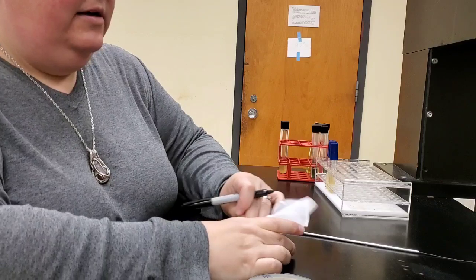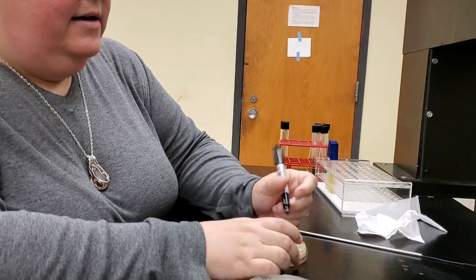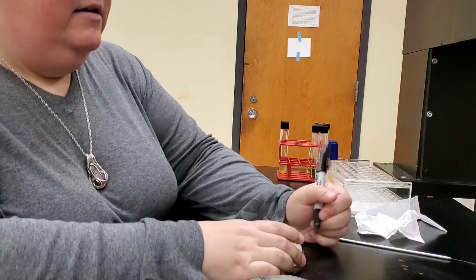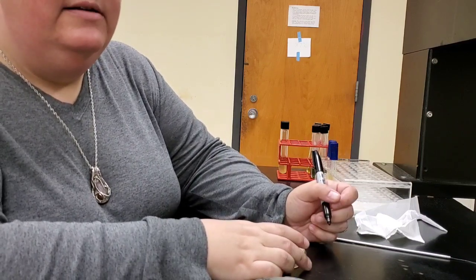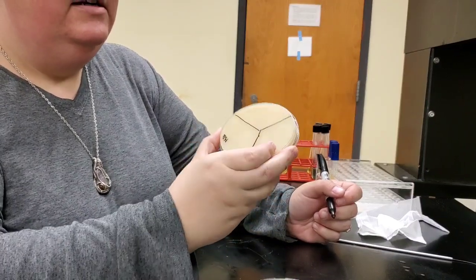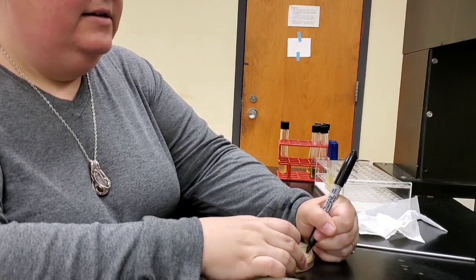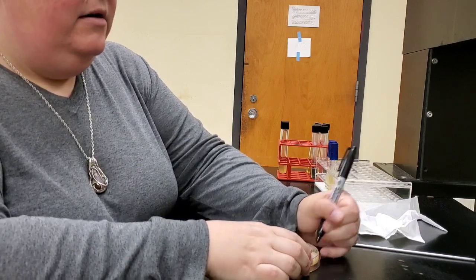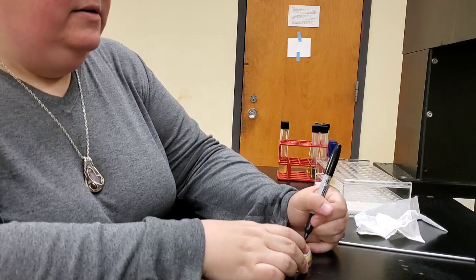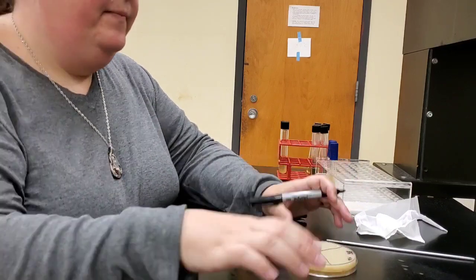The milk agar plate tests for the production of caseinase, an enzyme that breaks down the protein casein in milk. That protein is responsible for making the milk appear white. So you can see this casein plate has a white color to it as a result of that casein protein being present. So we'll label these sectors the same as we did our starch plate.